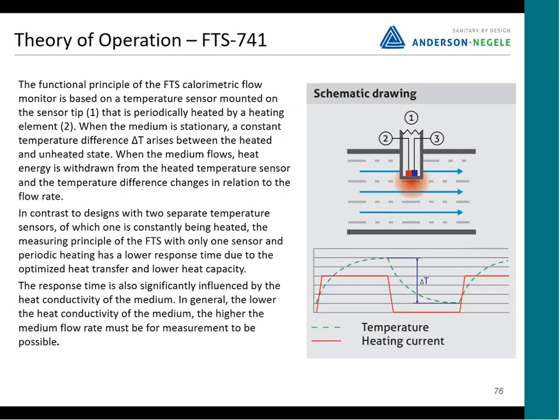How does it work? It basically works by putting a little heater in the probe and a temperature sensor sitting right next to it. And as the flow goes by, it's going to pull the heat away. I often compare this to if you're standing outside on a day that's not too sunny, you've got short sleeves on, and you're very, very comfortable, and all of a sudden there's a slight breeze, and you feel a little cooler, even though the temperature hasn't changed. And that's the wind pulling the heat away from your body. Well, that's what's happening here. That flow is pulling the heat away from this probe.